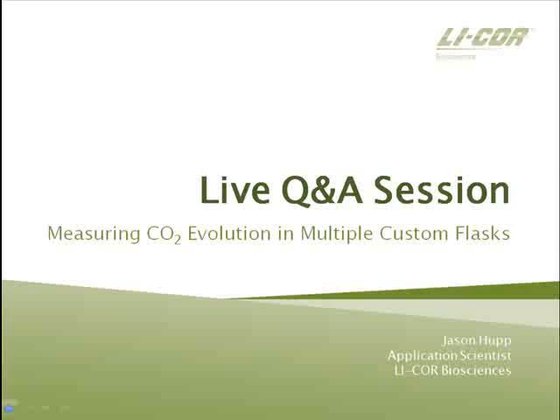Thanks, Jason. Our next question is, how frequently can individual chambers be sampled? The frequency with which you can sample a chamber is dependent on the number of chambers you're using and the observation length used for each chamber. Because they're sampled sequentially, you can think about it being additive. So, for example, if you had 10 chambers and you were using an observation length of 3 minutes, you could sample each chamber every 30 minutes.